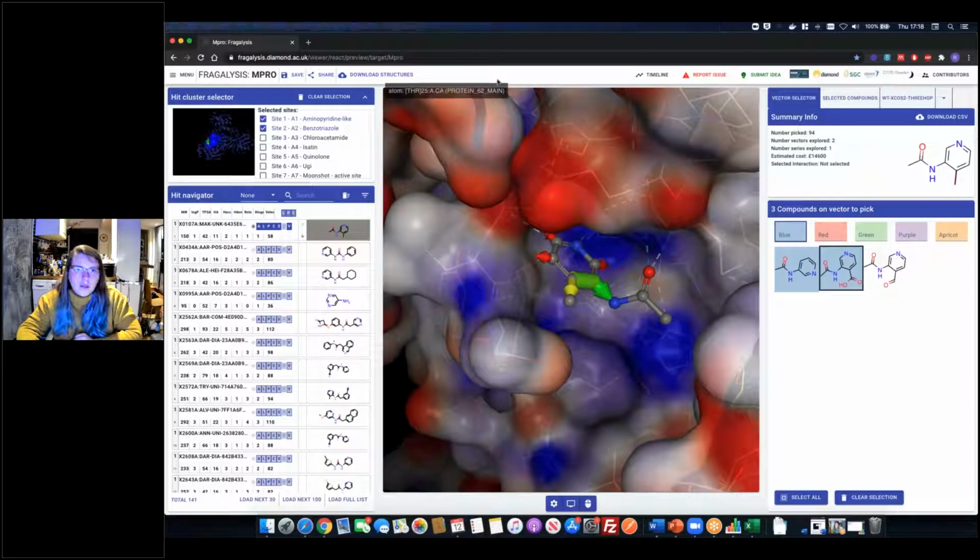So the next thing we can think about, before I move on to the computational data, somebody asked about sharing the state of the page. There are two concepts in Fragalysis for this. I'll show you the first one. I imagine most of the people on the webinar won't have a login for Fragalysis because it's done through Diamond's login system. I can show you in a little while how to create one of those logins if you want to, so that you can use the other feature.